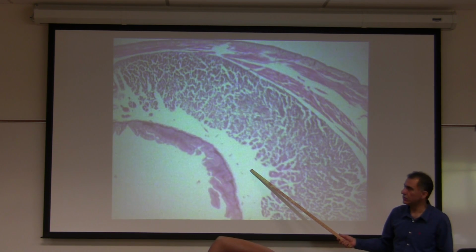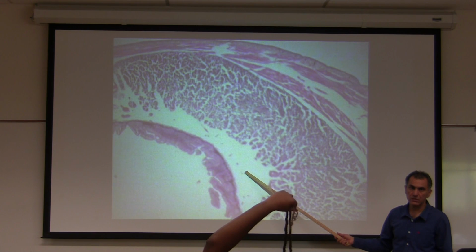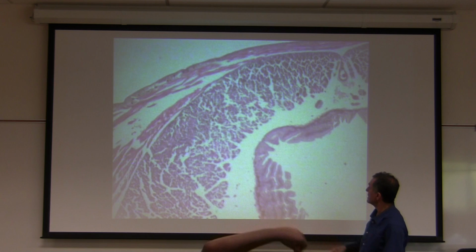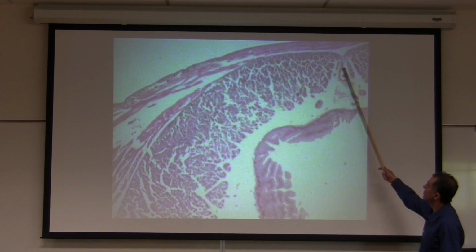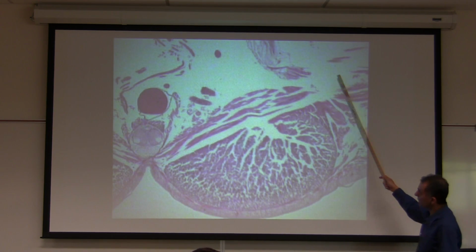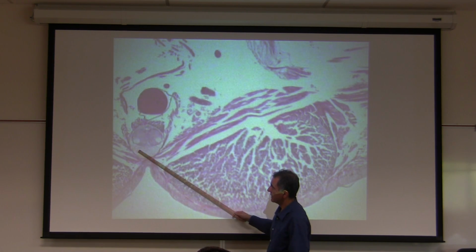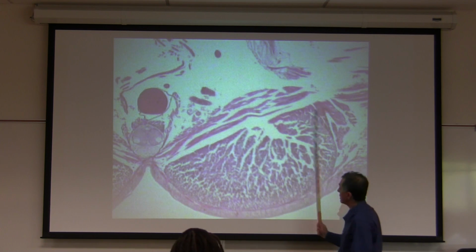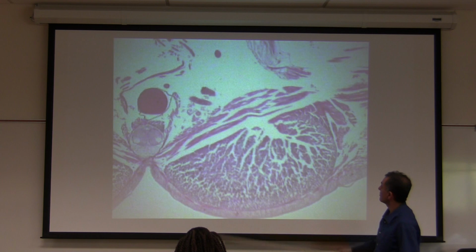What is the name of the area? No, these are not pseudocoelom. These are coelom. They are eucoelomate animals. Nereis virens is a coelomate animal. Same thing here, intestine. The only thing I want to show you is the blood vessel. Here is a blood vessel, here is a nerve cord, the nerve and the blood. Again, you have longitudinal muscles, circular muscles, and some kind of oblique muscles.